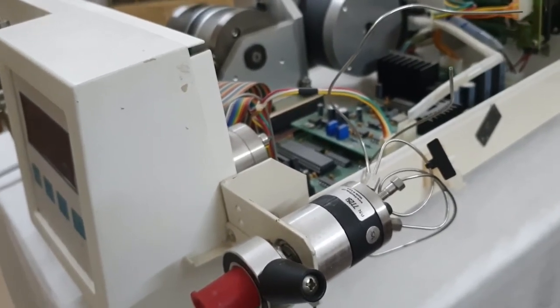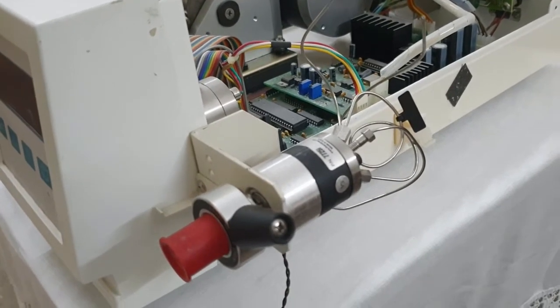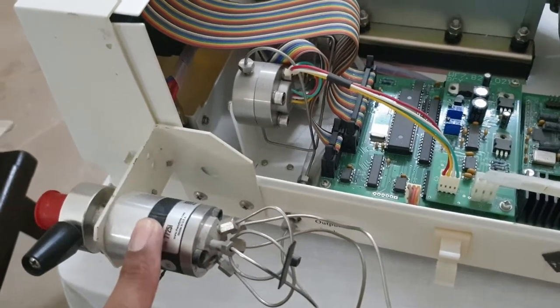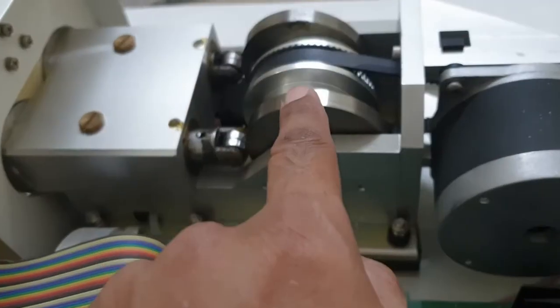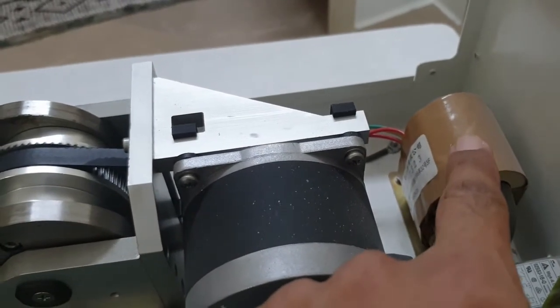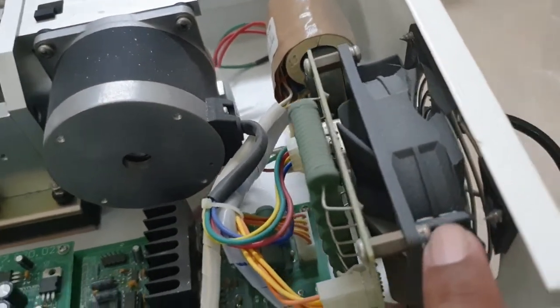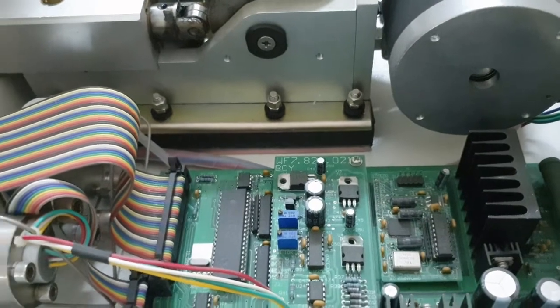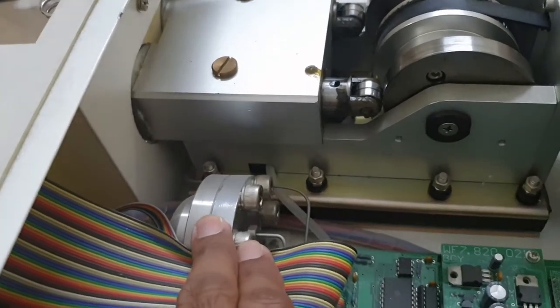We will start the pump while connecting the solvent and then see how the leakage appears. Now I will explain the different parts of this pump. This is the manual injector, this is the transducer, this is the motherboard, this is the crankshaft and stepper motor, this is the transformer providing power supply to the motherboard, and this is the exhaust fan which exhausts the hot air produced inside the HPLC pump.